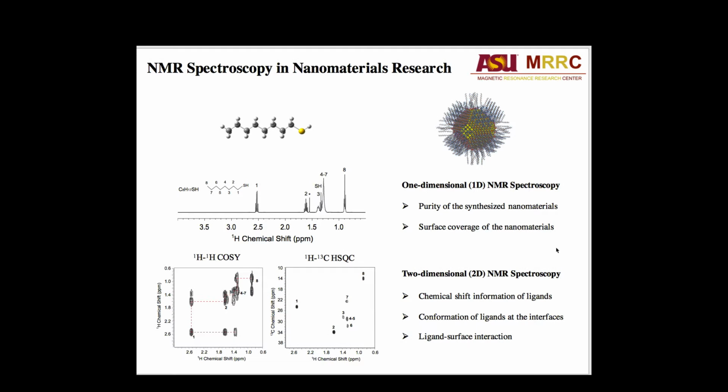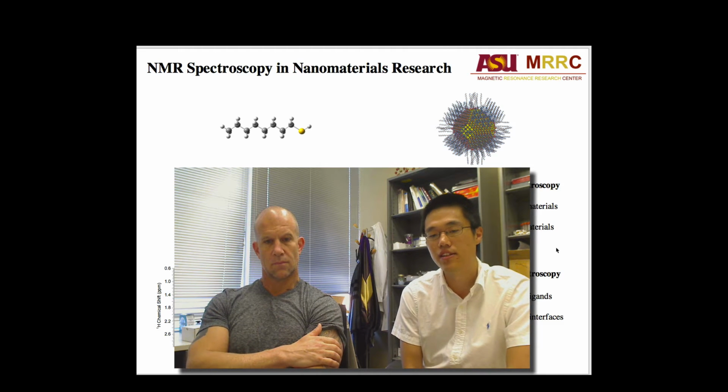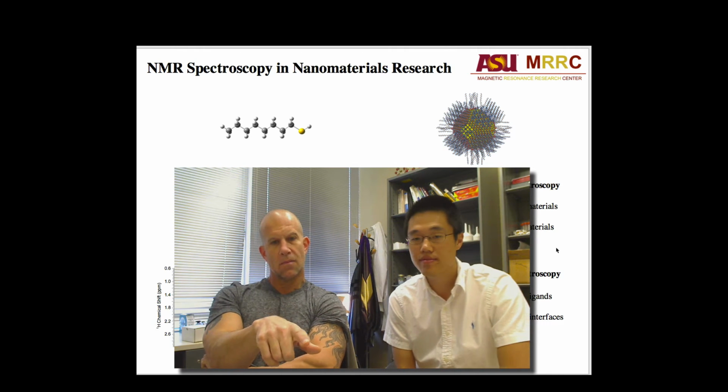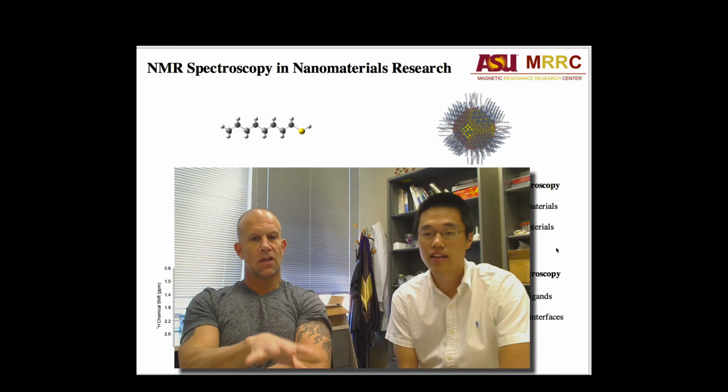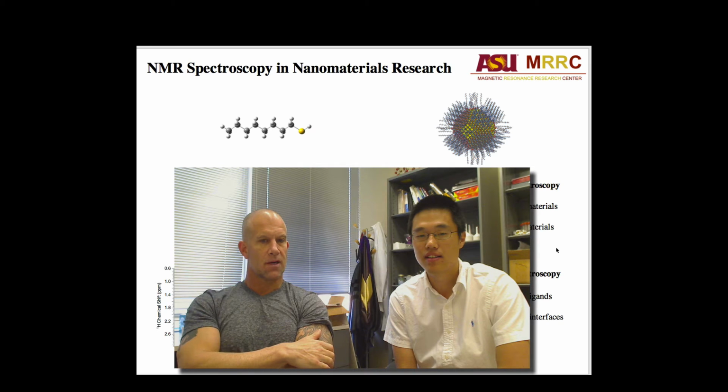So first, when we go to the real stuff, let's review a little bit about NMR spectroscopy in the research of ligand capping behavior at the surfaces. So Chen Chen, what is the molecule you're showing here? And this is just the NMR of the molecule, not attached to the nanoparticle, right?